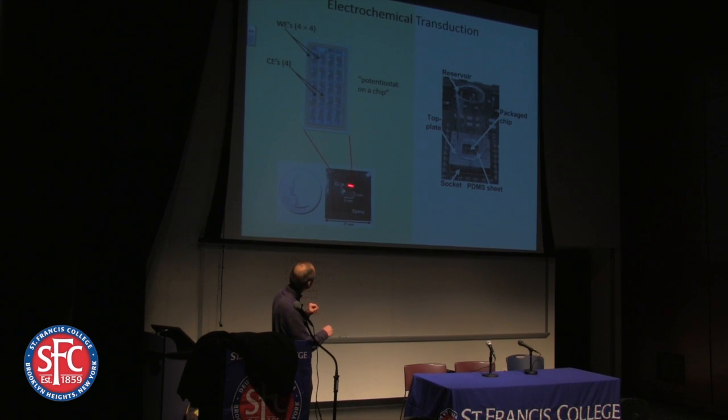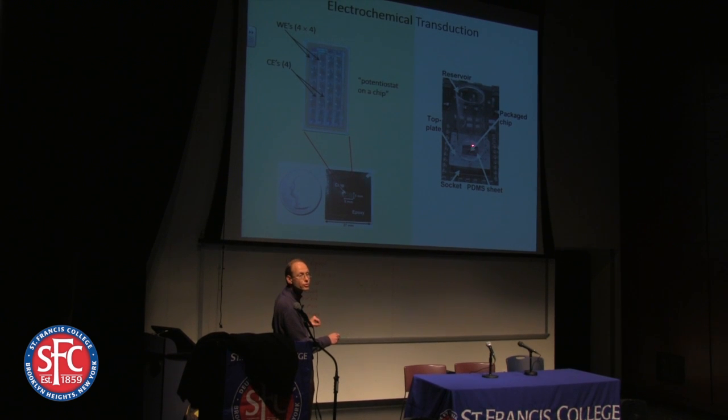And this is epoxy, so this protects the local circuitry. And then this glass vessel protects against liquid getting spilled over onto the board. So we just fill this with a few milliliters of solution. We can also put in a reference electrode in there. And that's how we confine it.